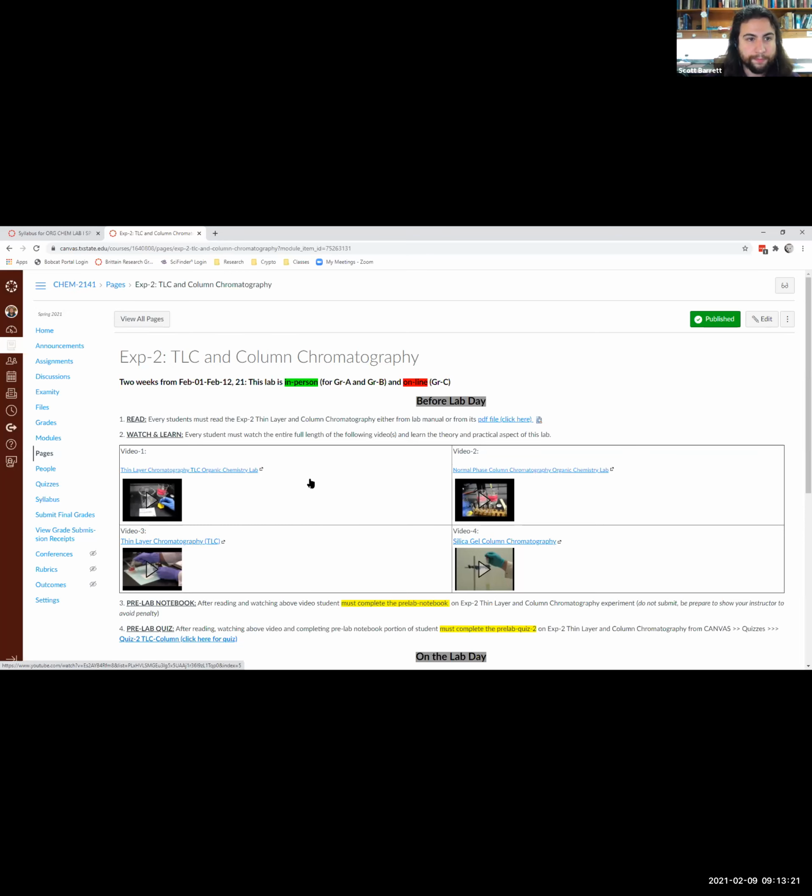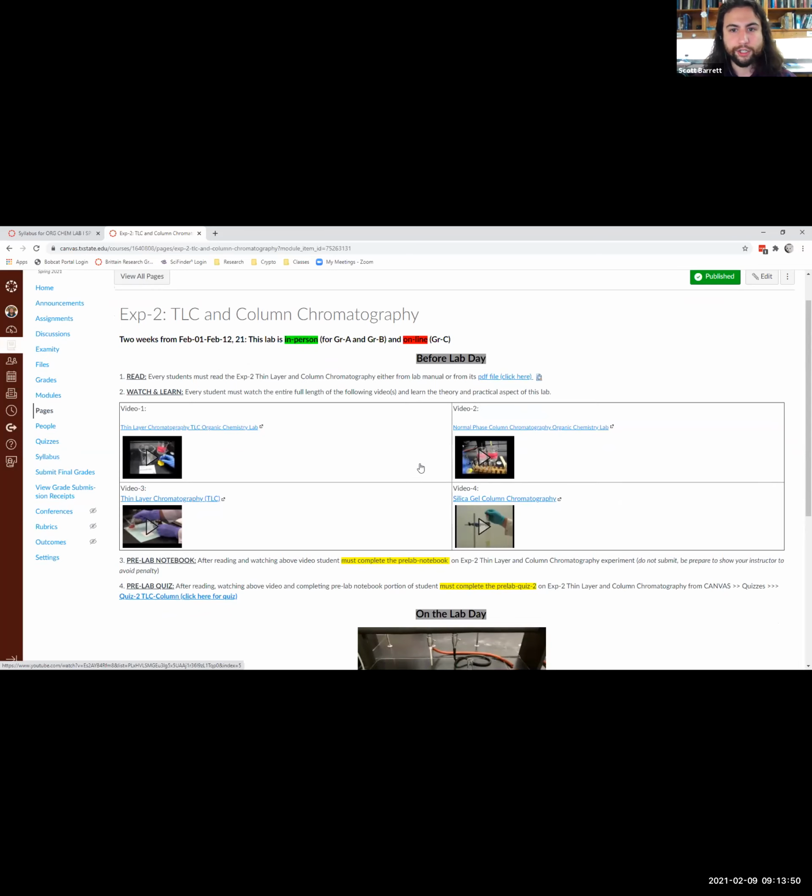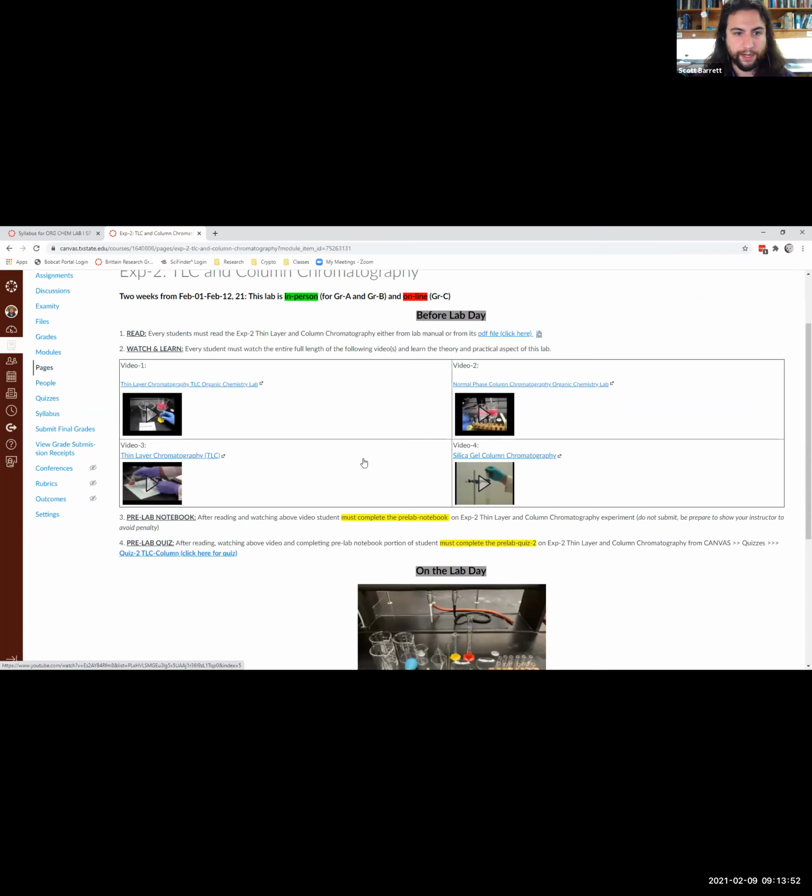I personally love this subject because it is so useful within chemistry, especially for separating compounds. It's really amazing how you can synthesize something and have 100 different things in your mixture and be able to just pull one thing out. And not only is it useful within research, this is useful within the industry too, with regards to creating things that we use on a day-to-day basis, and they can pull it out of a giant reaction mixture in this massive cauldron where they create these things. So this is extremely important within the science community.